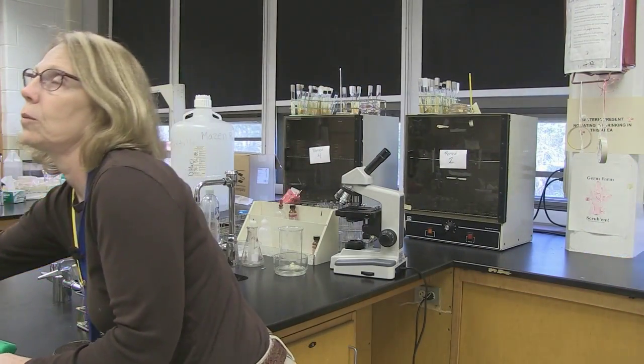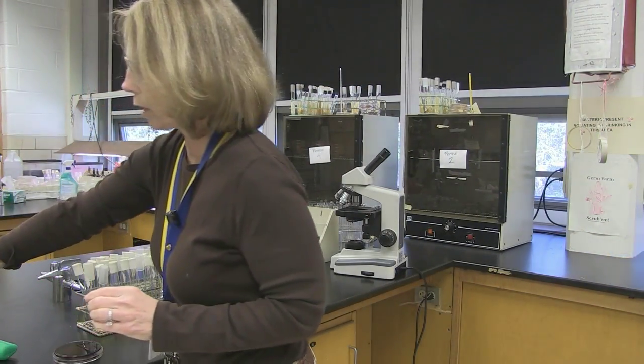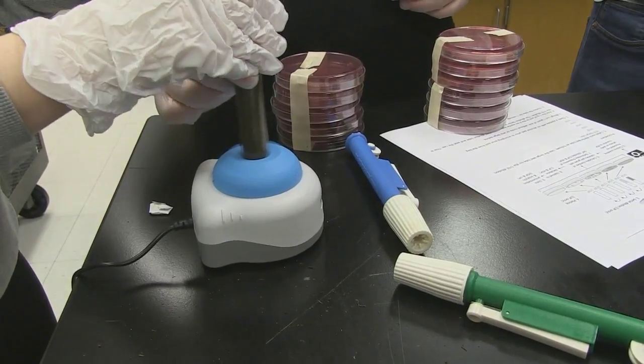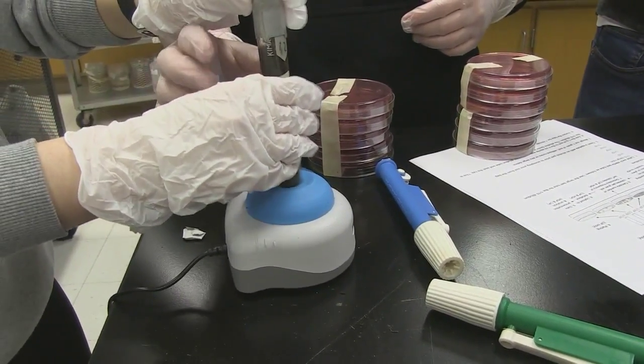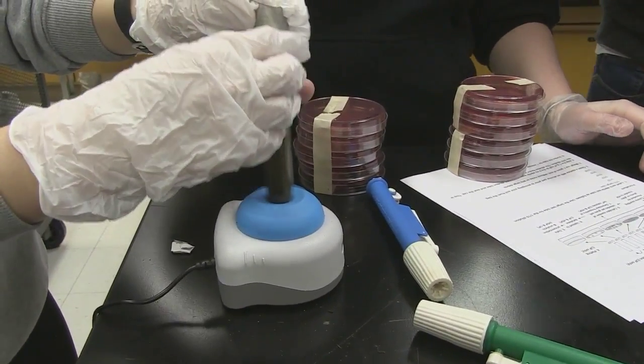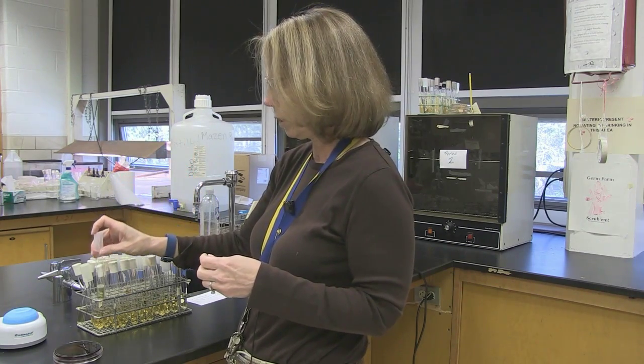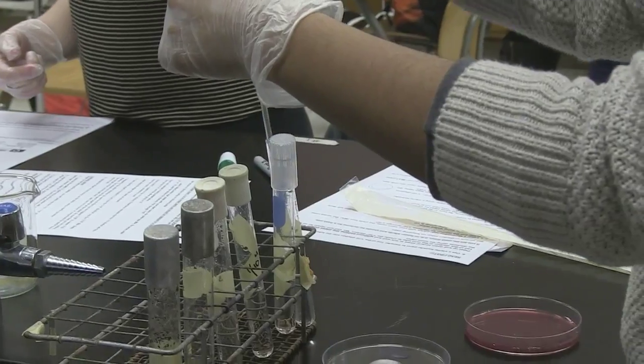One of the other fun things that people like to use is a vortex. The samples have to be mixed well so that all the bacteria are evenly distributed throughout the tube. After the bacteria is put into the tube, it is placed on the vortex, which basically mixes it — it's like an automatic mixer, because our tubes do not have screw tops and can't just be turned upside down.